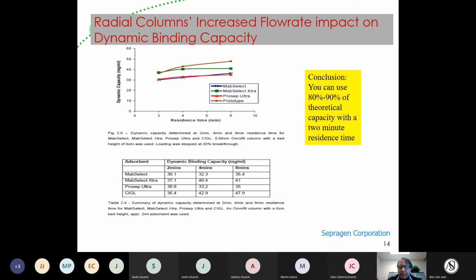Today, the resins are very different. Firstly, the resins are more rigid. They have macroporous pores, so liquid can diffuse in and out much faster. And then you also have tentacles where the ligands are, at a distance from the bead itself. They have long chains or bushes hanging off these beads, so the mass transfer limitations are very low, and therefore the molecules can bind much faster and get off much faster.